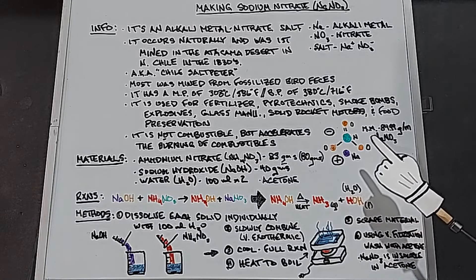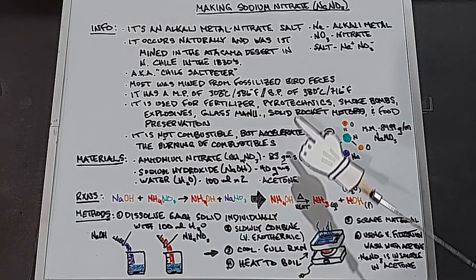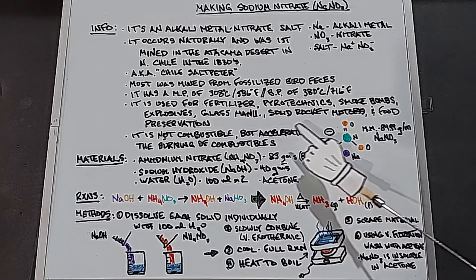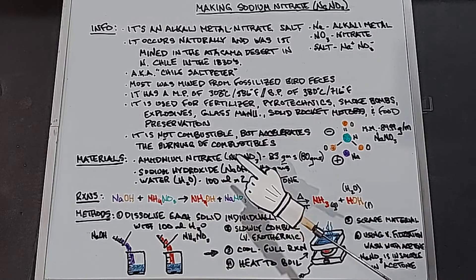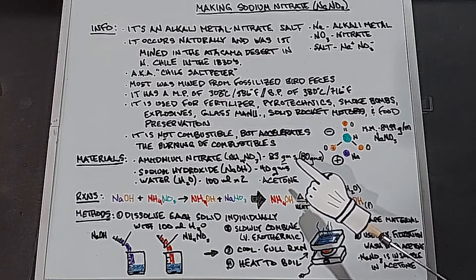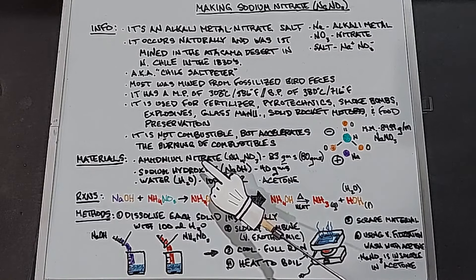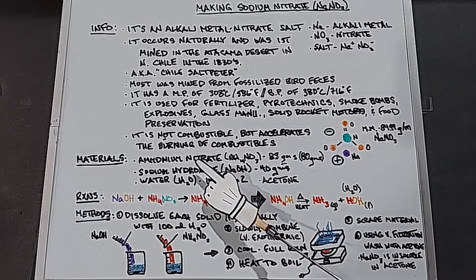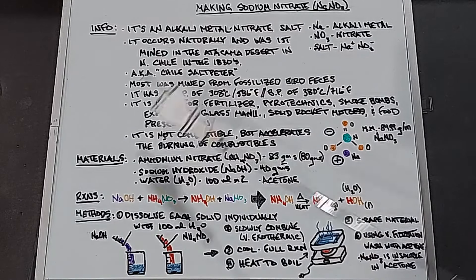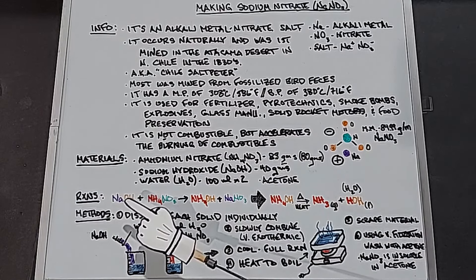The materials we need are ammonium nitrate NH4NO3, 83 grams — it actually requires 80 grams but we use a slight excess — and sodium hydroxide. We want all of the sodium hydroxide used up because when we purify with acetone at the end, sodium hydroxide is soluble in acetone but sodium nitrate is not, so we'll be able to wash it successfully. We also need water, 100 milliliters times two.